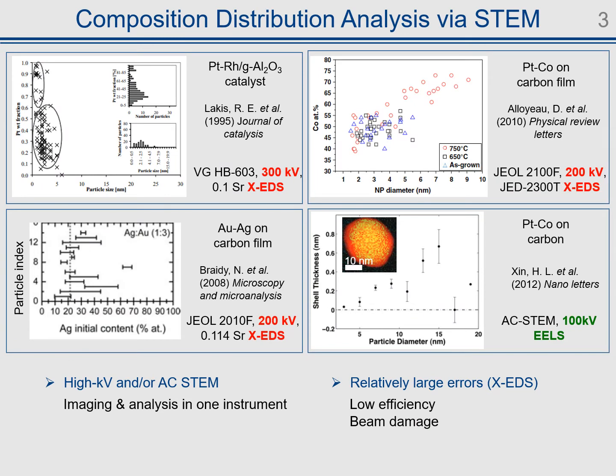Here I listed a few studies in the literature where the composition distributions of nanoalloys were actually reported. Several common features can be observed. Firstly, in all cases, the composition of nanoparticles varies significantly from particle to particle, indicating the difficulty of controlling it during the synthesis and the necessity of this type of analysis.